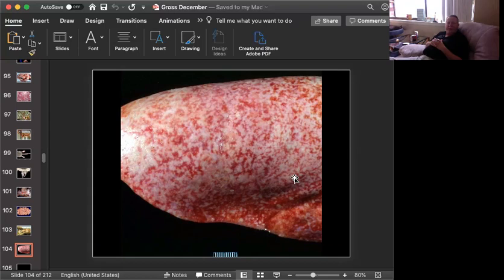I never can remember. I think it's posadasii. And so there is another one there. Cryptococcus neoformans, I suppose you have to lump it in there. Why not? I haven't seen one that's this bad with Cryptococcus, but it's big. It won't collapse. And I'm going to put my dimorphic fungi first.